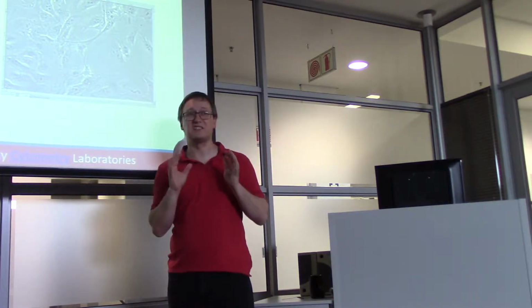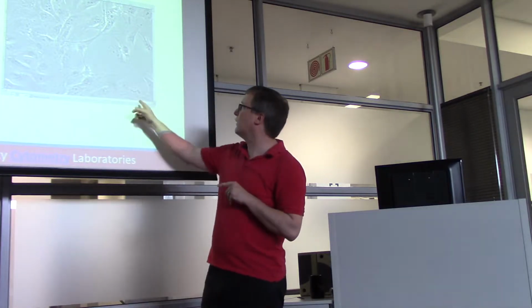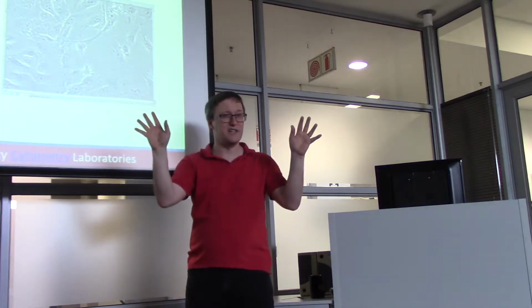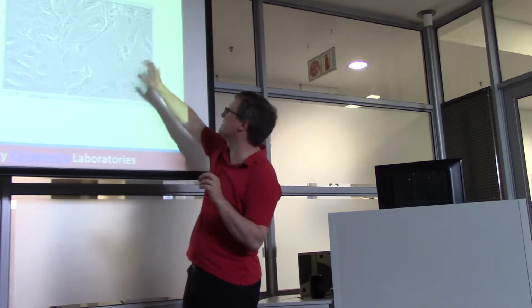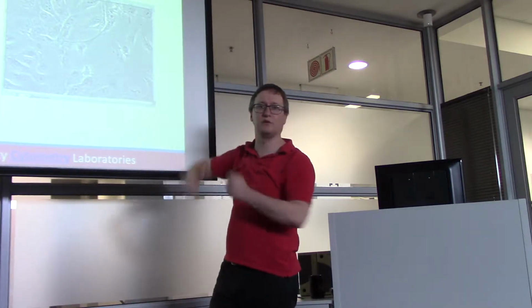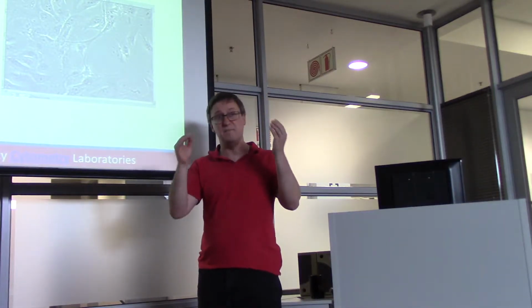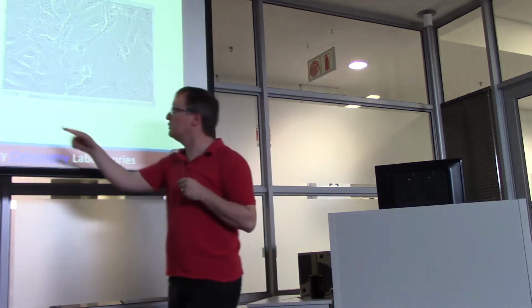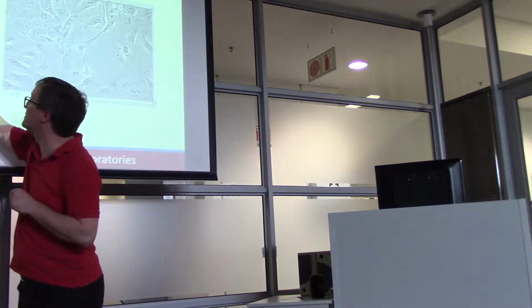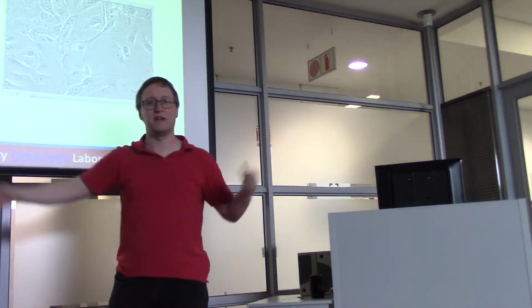Well, let's start with a histogram. Everyone remembers a histogram, right? We produced one of those yesterday. In this case, we're going to ask, what is the popularity of each level of intensity across the megapixels that we have available to us. Maybe we've shot a 10 megapixel image. That means we have 10 million intensities, and we want to see which ones are most popular. So we see that in this case, we have a whole bunch of measurements that fall in this medium range intensity, and some that spread out to the other ends.